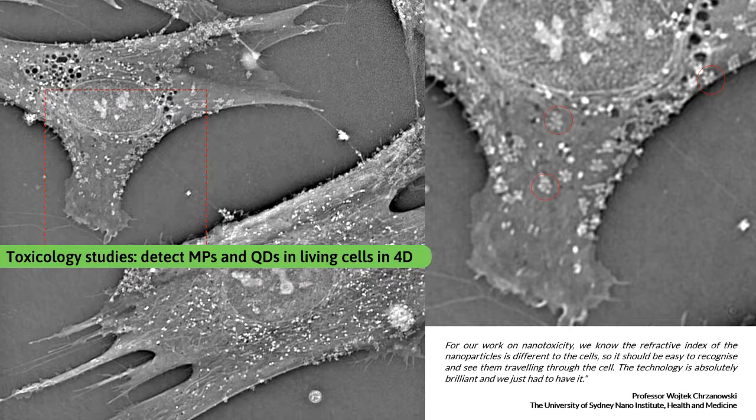Those are human fibroblast cells that are treated with titanium oxide. In this case, you have the nanoparticles sitting on top of the cell, and they are forming this multi-star structure that you can see pointed out here with the red circles. So around the nucleus, on the periphery, and stuck on the membrane. That is a very clear observation of how these particles are sitting on the cell.